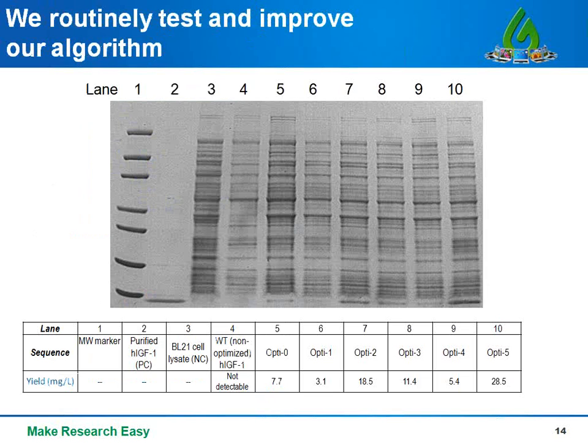So this is why some customers like to order multiple codon-optimized sequences and test them side by side to see which works best in their lab. But in most cases, people don't bother ordering multiple genes that are codon-optimized in different ways. Just a single codon-optimized gene is generally sufficient.